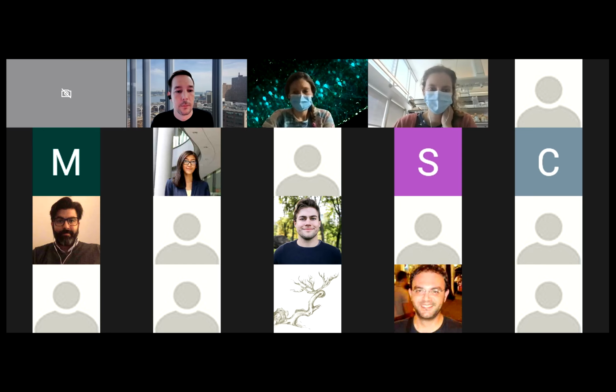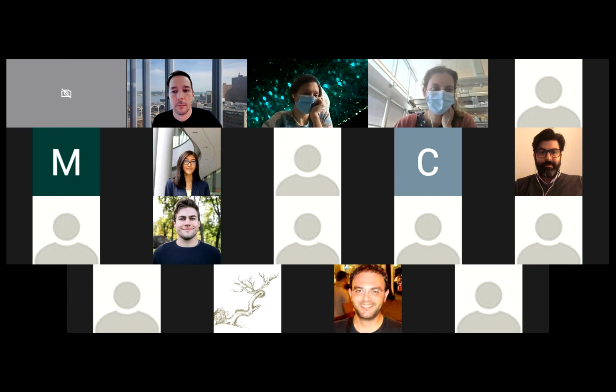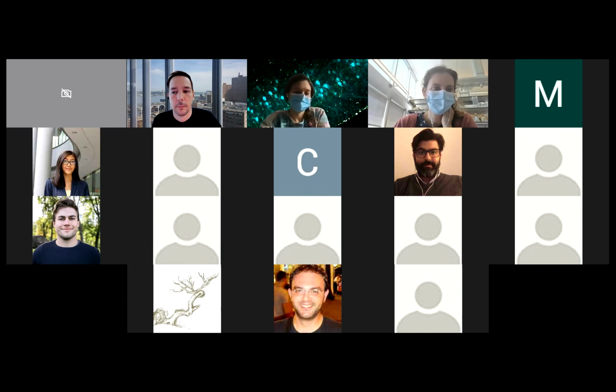Luke, I have a question about the registration in terms of results. I understand that if you have damage on the slice, I use a lot of whole brain; I'm still using WholeBrain as software for doing that. When I have a problem, maybe because there is an asymmetry from brain cutting, I now mirror it. I slice the brain in a hemisphere and then mirror, so I use the same atlas reference, but I know that it's just half that I'm going to consider for counting.